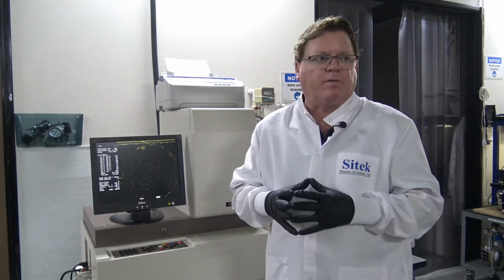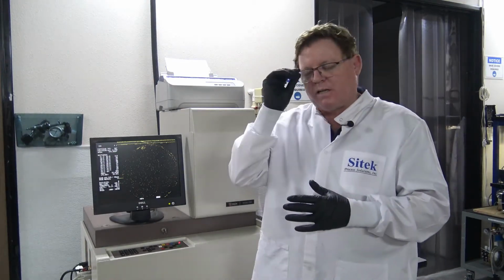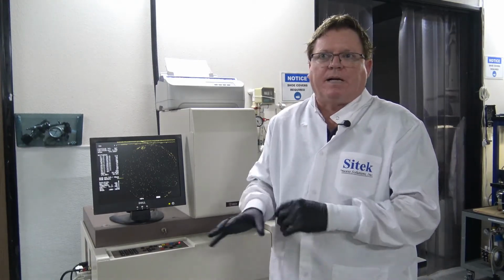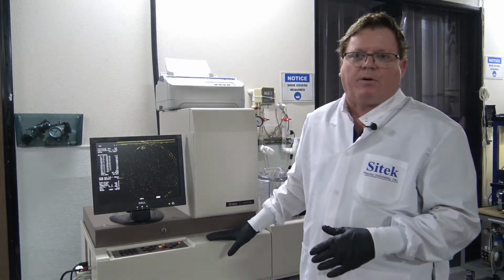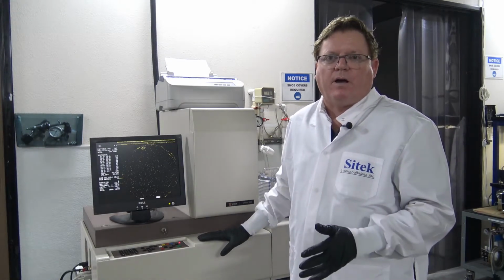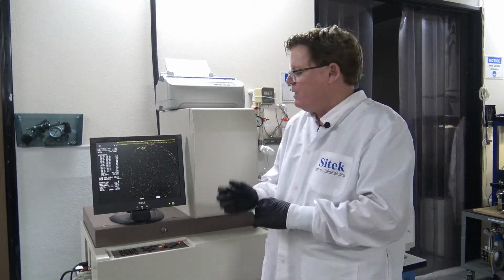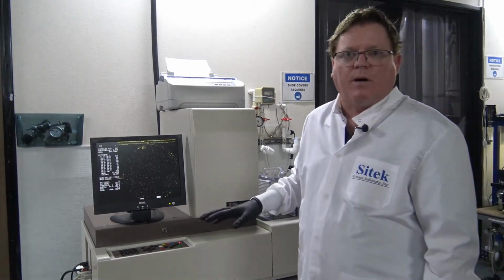What I'm going to do now is, we've gone through lots of cycle testing. Because we're in a non-fab environment, the particles are high on the test, which we expect, and they'll get higher after each run. Because of the environment we're in, the tool has not been recalibrated. It has to be calibrated once it arrives in the clean room with a correct VLSI calibration wafer. Otherwise, we'd ruin the calibration wafer as soon as we took it out of the box, and that'd be a $1,000 wafer ruined.